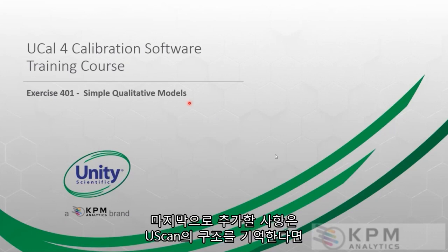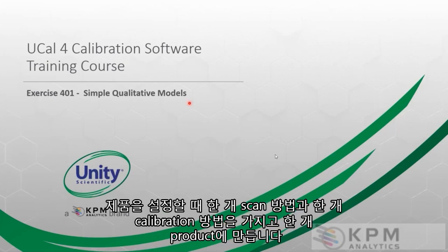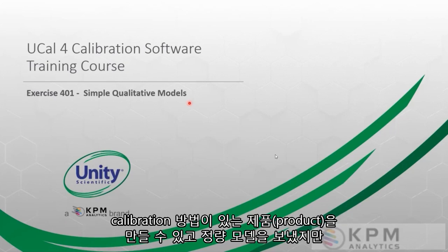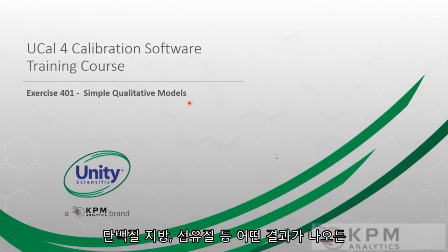The last thing I will add about qualitative models is that if you remember the structure of U-scan, when you're setting up a product, you have one scan method and one calibration method, and you combine those into a product. It has to be at least one calibration method, but it can be more. So you can make a product that has a calibration method based on a quantitative model, giving your protein, fat, fiber, whatever results.